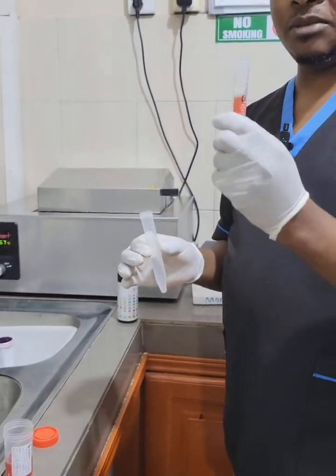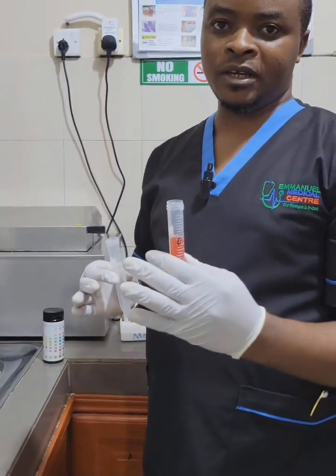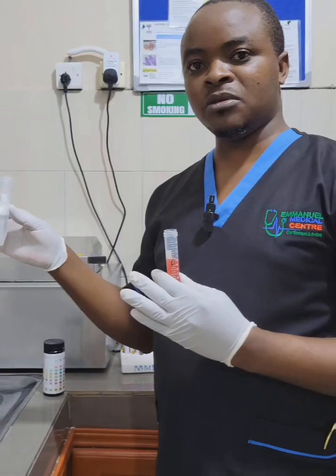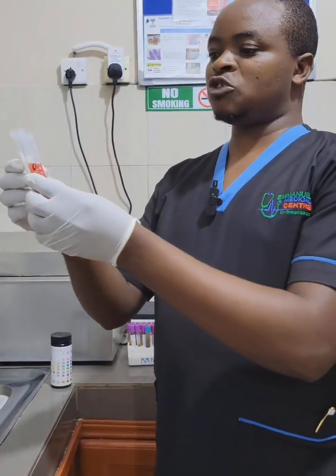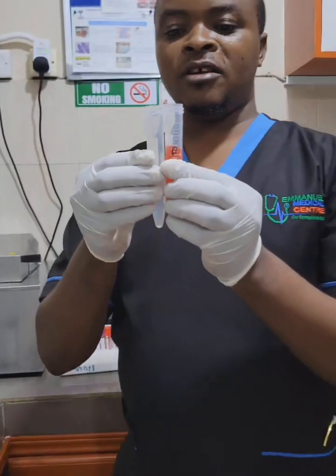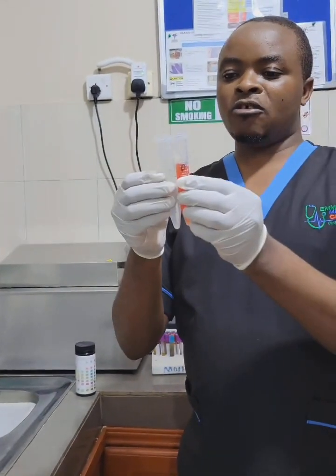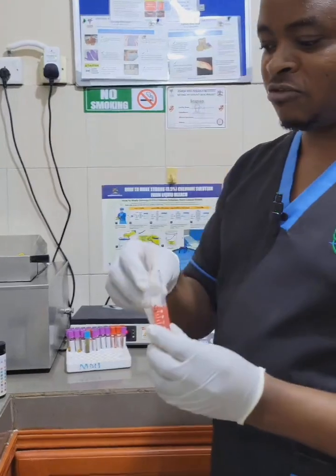So after putting 10 ml of urine, or some procedures say halfway, you then get another centrifuge tube and fill it with water to balance. So you make sure they are equal volumes. After making sure the volume of the other tube balancing and the one of the urine are at the same level, you come and load in a centrifuge.